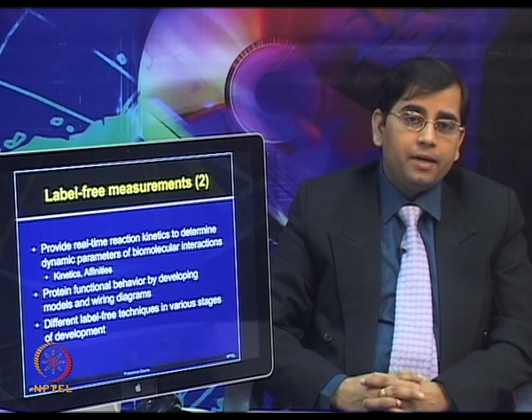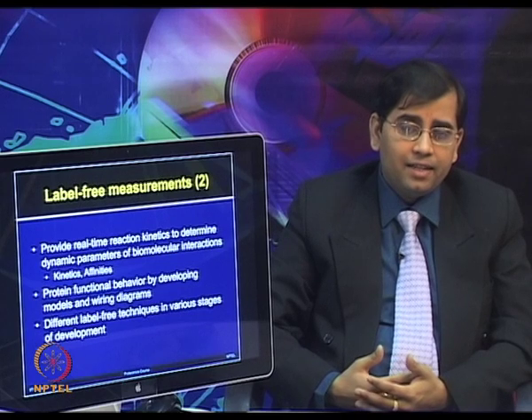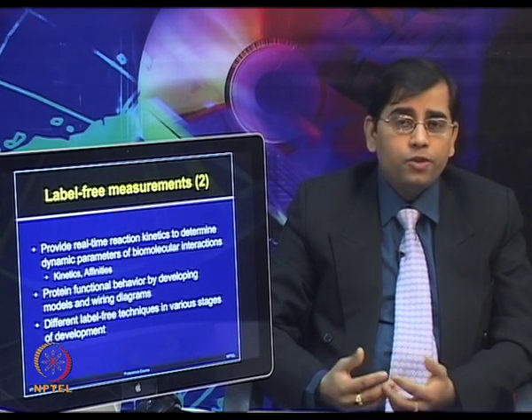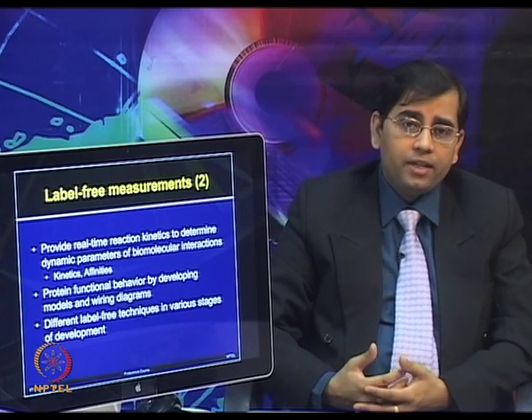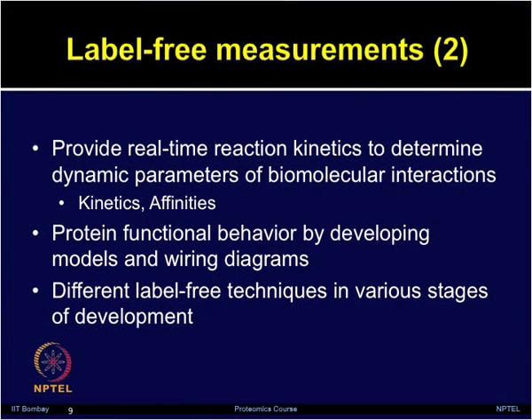The label free measurements have advantage over the label based techniques as we discussed, and one of the most striking advantages here is that they can provide real time reaction kinetics, which can determine the dynamic properties of biomolecular interactions such as kinetics and affinity.